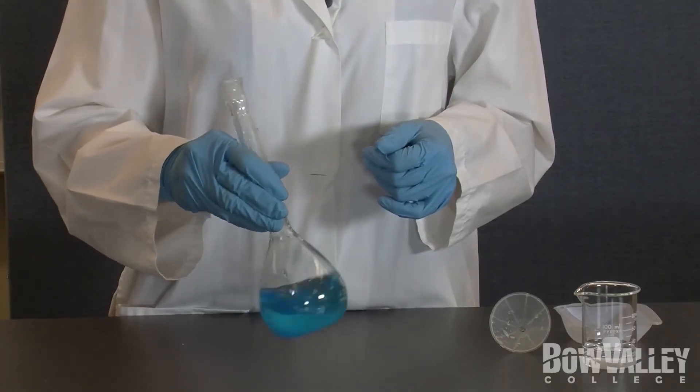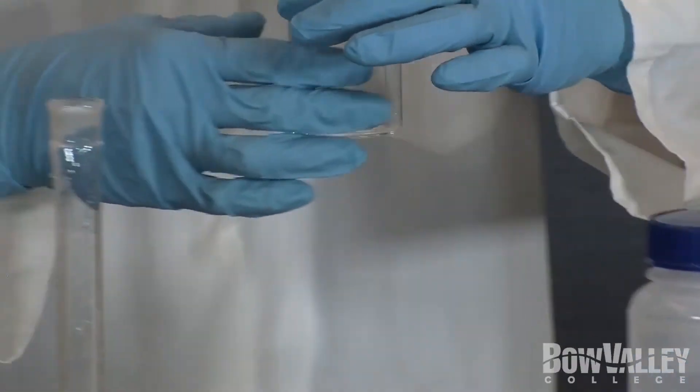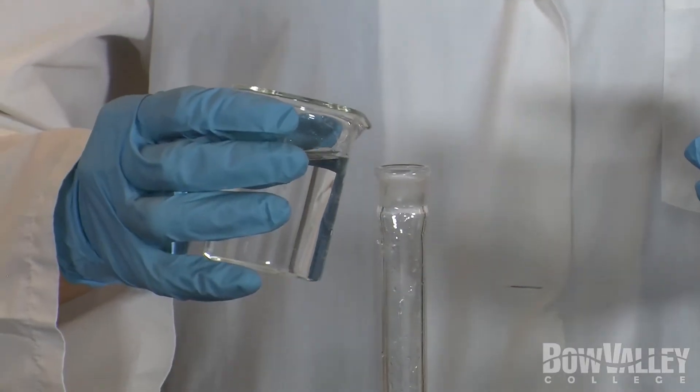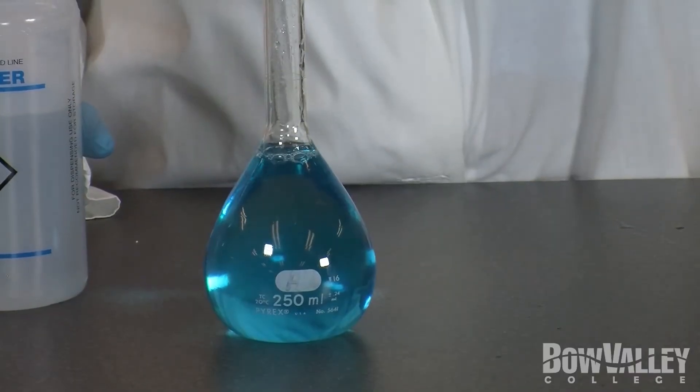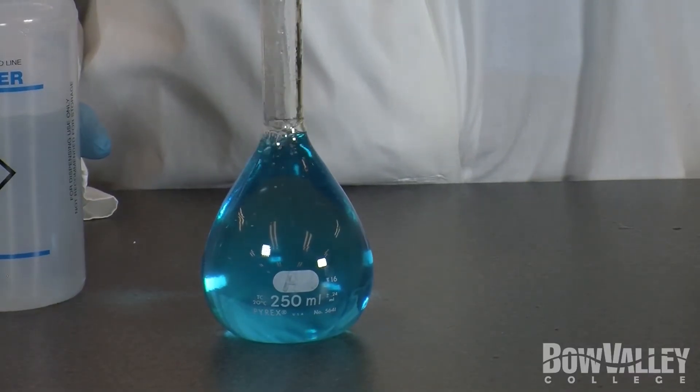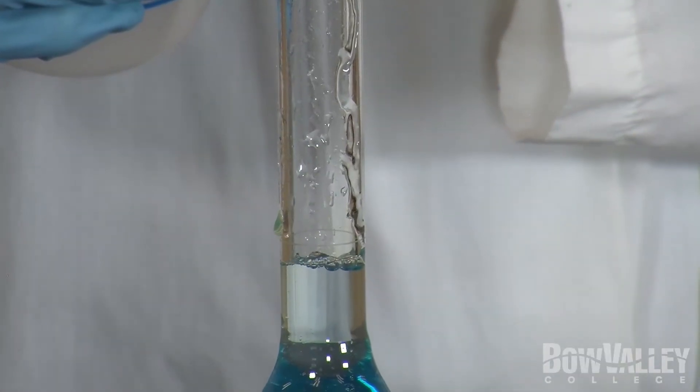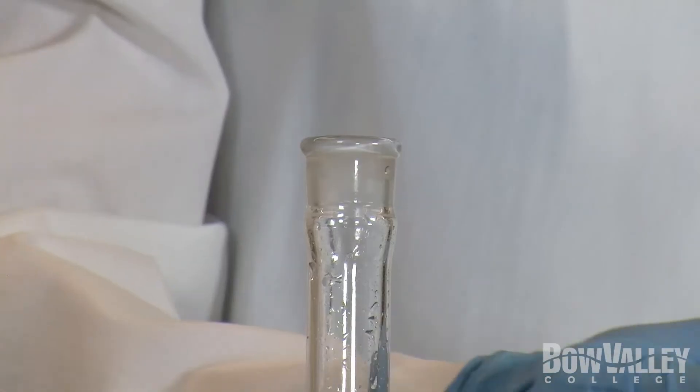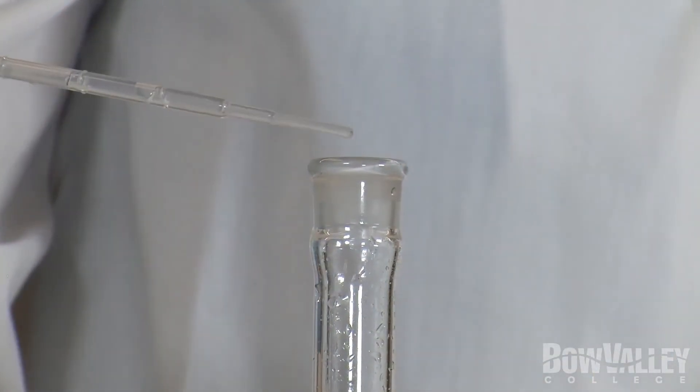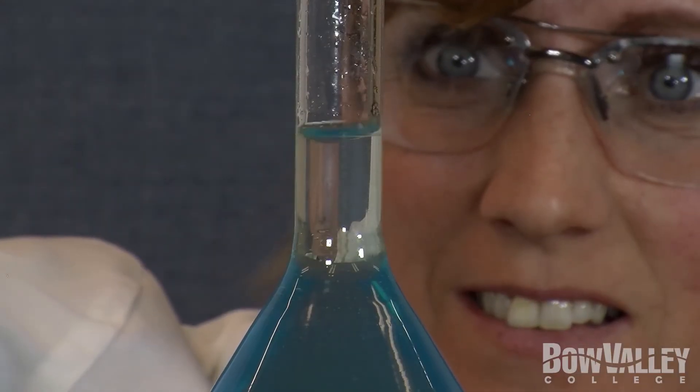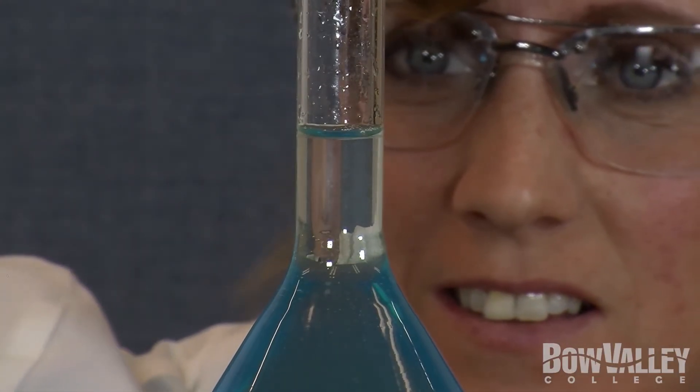Gently swirl the solution until the solid is dissolved. Dilute carefully by adding water from the 100ml beaker until the water level is about 1cm below the graduation line on the neck of the flask. Use a disposable pipette to add the last few drops ensuring that the bottom of the meniscus is at the graduation line.